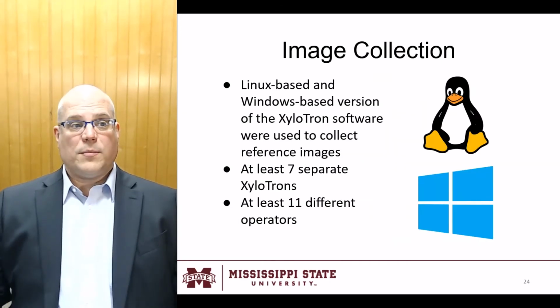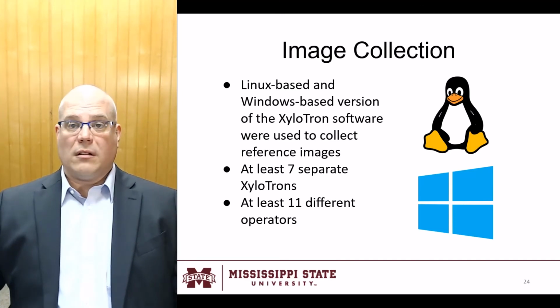Linux-based and Windows-based versions of the XyloTron software were used to collect reference images. At least 7 separate XyloTrons were used by 11 different operators.